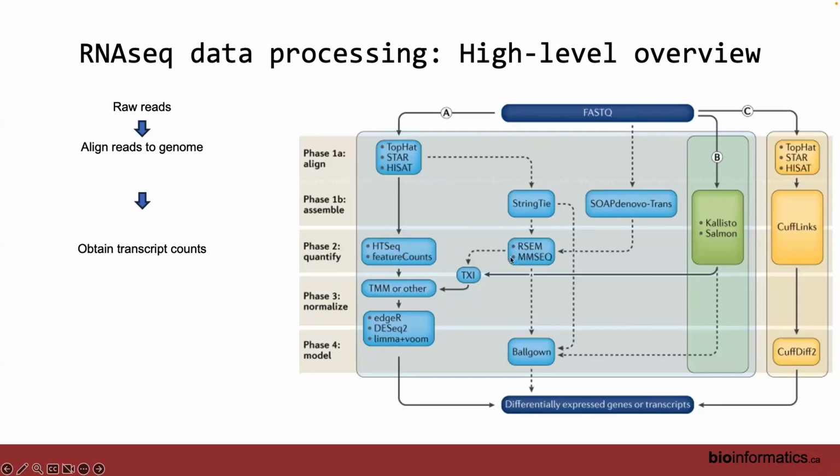So now we have mapped the reads to particular pieces of the genome. Now it's time to count how many reads fall into this exon, how many fall into this transcript, and you bucket things like, okay, this read maps to this exon, and this exon is only in this transcript. Therefore, this read maps to this transcript. All that is done, and then you get a nice table on a platter, right? Finally. So you get your transcript counts.